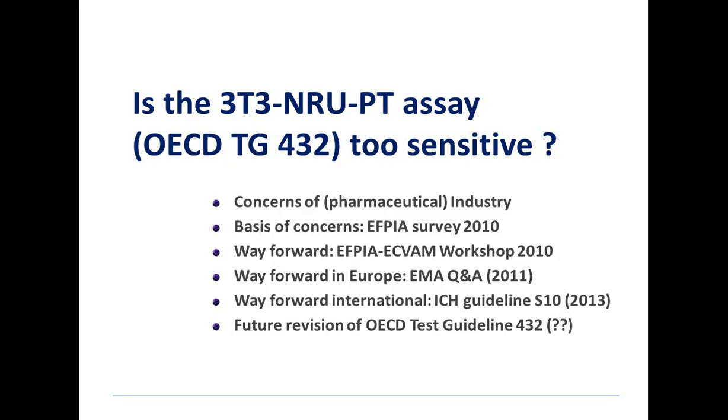is now usual that we don't have special European regulations. We just get this harmonized at the ICH level, that is the International Conference on Harmonisation, and they generated a new guideline called S10 on photosafety testing. This is currently in step 3 of the whole procedure.